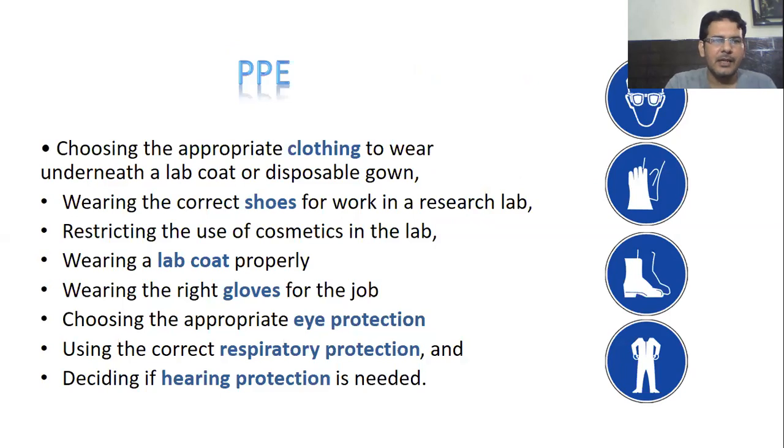So what are the PPEs? It's very important that we should choose the appropriate clothing to wear underneath the lab coat or disposable gown, and then wear the correct shoes for work in a research laboratory. In addition, we should restrict the use of cosmetics in the laboratory. We should wear the lab coat properly and wear the right gloves for the right job. We should also choose appropriate eye protection — this is very important — and use the correct respiratory protection and also hearing protection.